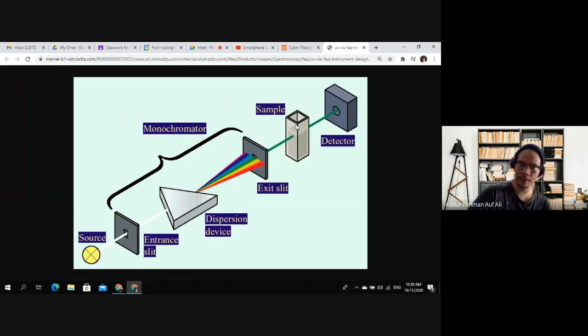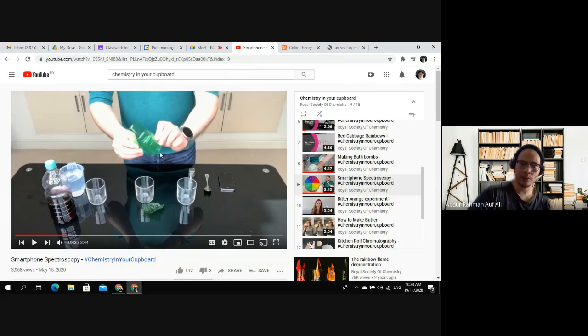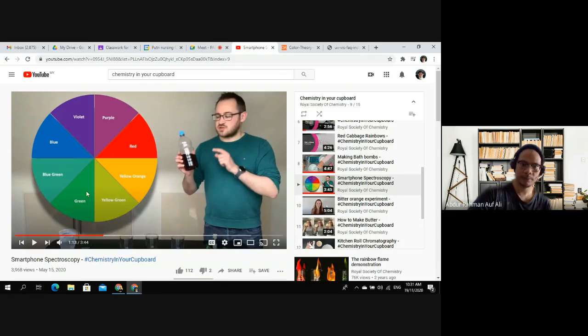So the amount yang absorb tu boleh diukur oleh spectrophotometer. Okay, so that is why kenapa dia ada guna this green plastic wrapper tadi. Kenapa also kita perlu faham the wavelength, the UV visible spectrum, which is also learned dalam our first semester.